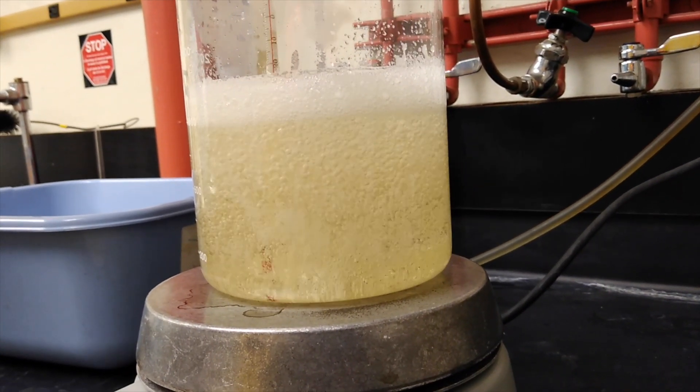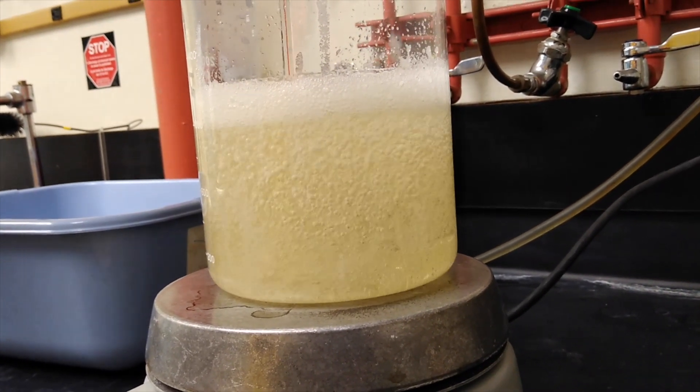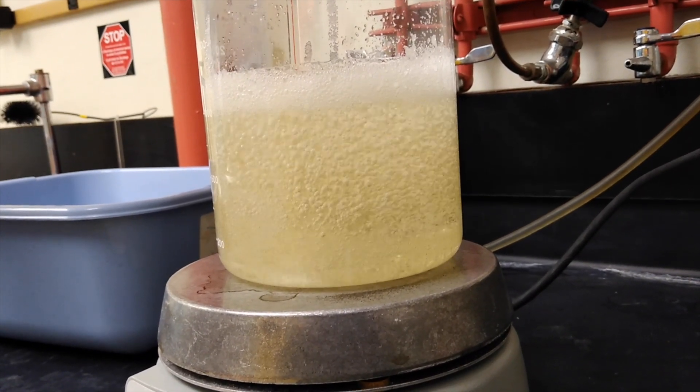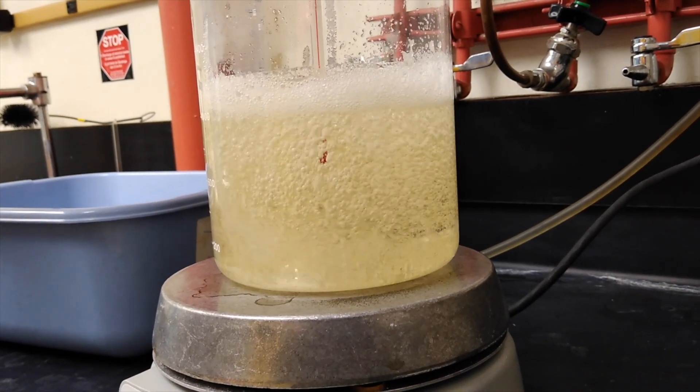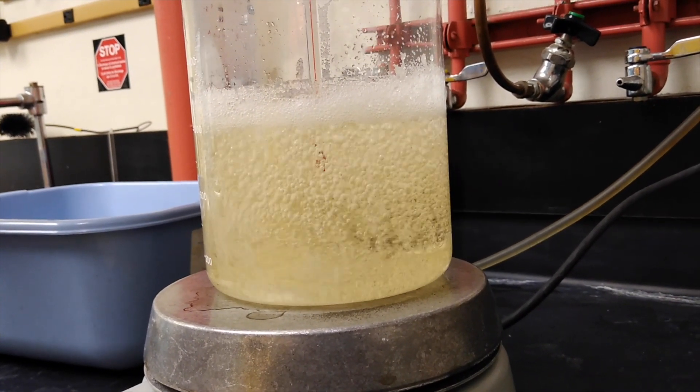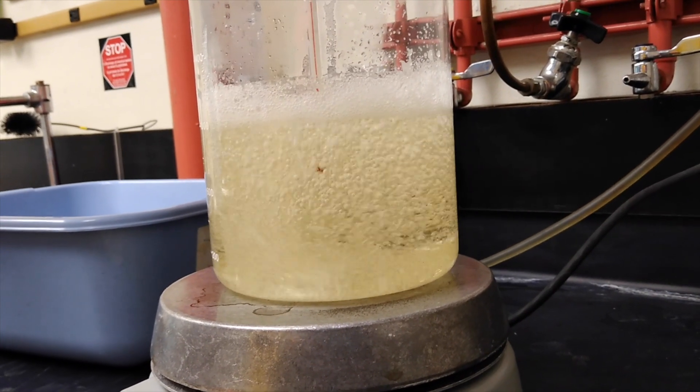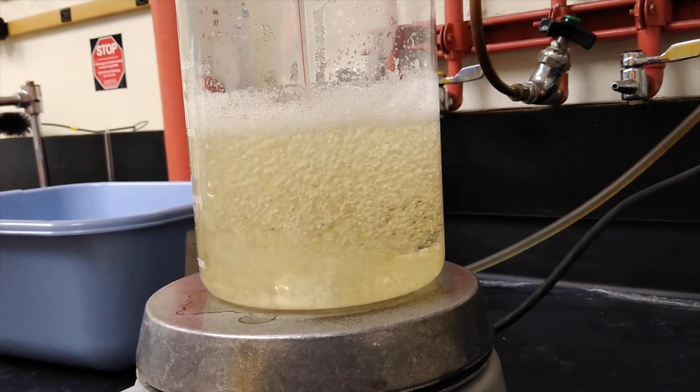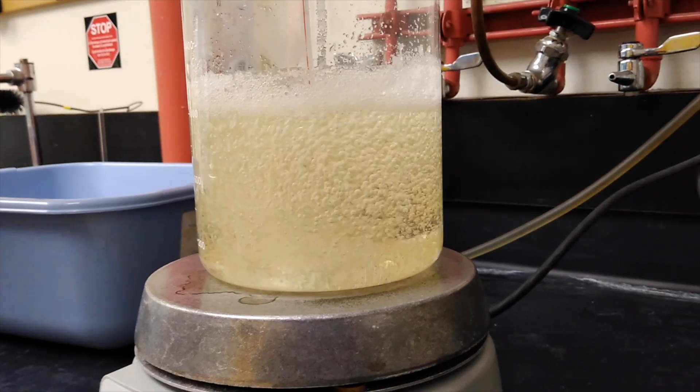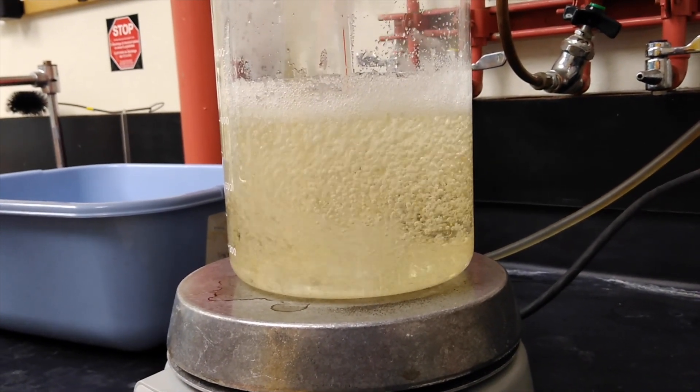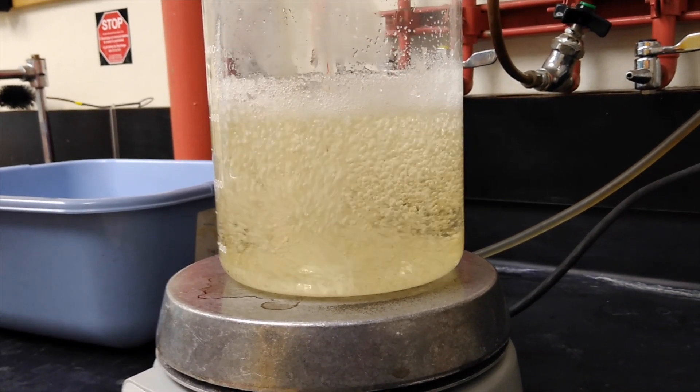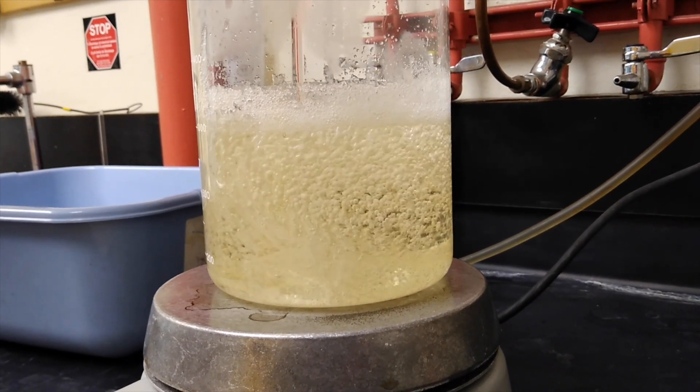When the sugar is all dissolved, the solution will be nice and clear. The temperature for this is around 110 degrees Celsius. This is what we call the syruping point. Now most of the sugar has dissolved, and we're about 15 minutes. This is about 110 degrees Celsius.